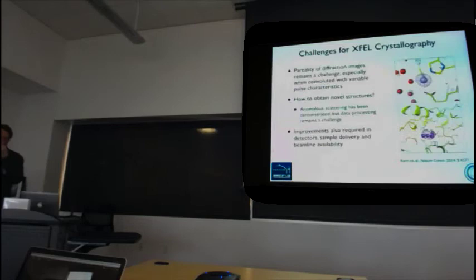So there are still challenges for crystallography at FELs. The data processing is non-trivial, as you'll hear. And it's probably why you're here to some degree, to learn why it's non-trivial and how to solve those problems. But we're dealing with experiments where we have partial reflections. It's not the typical experiment that we do at a synchrotron. And currently, the source of X-rays tends to be quite challenging in terms of the structure of the X-ray pulse.